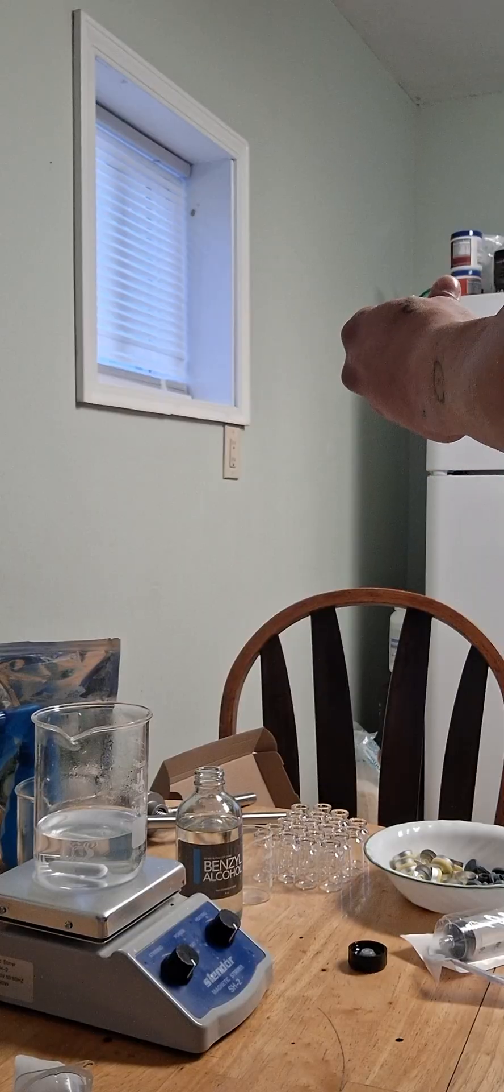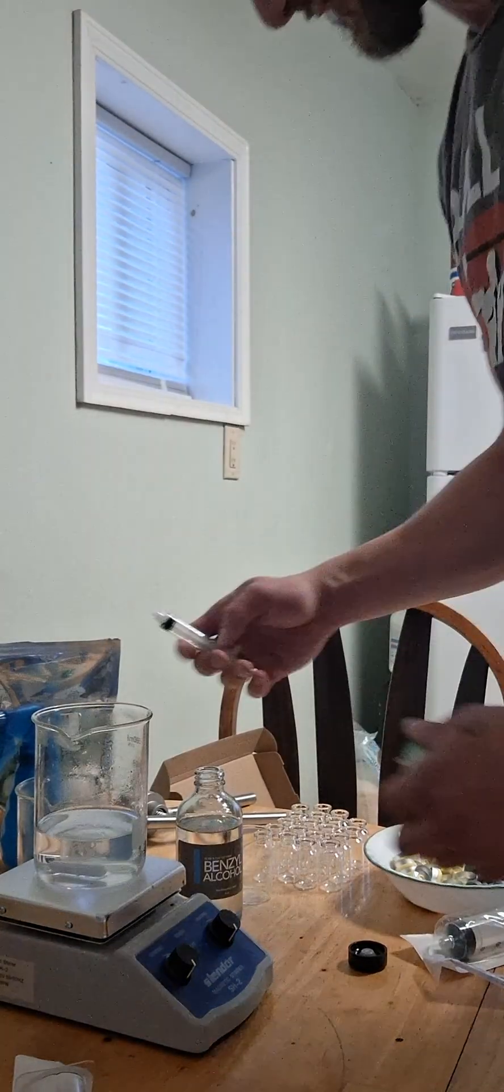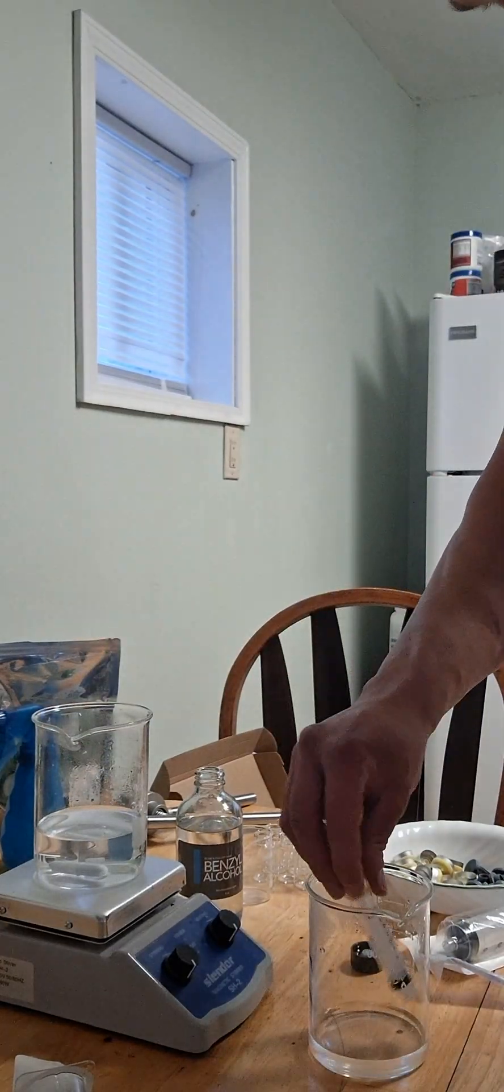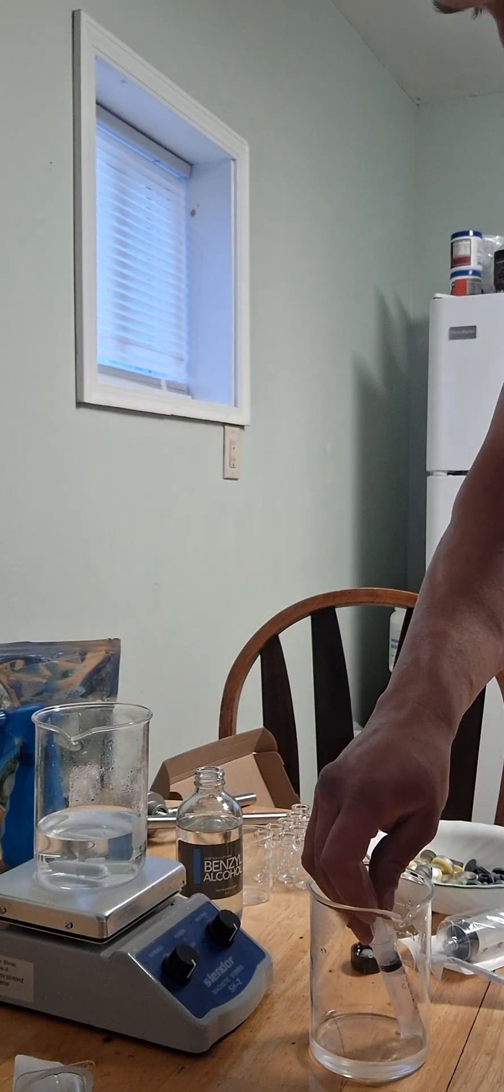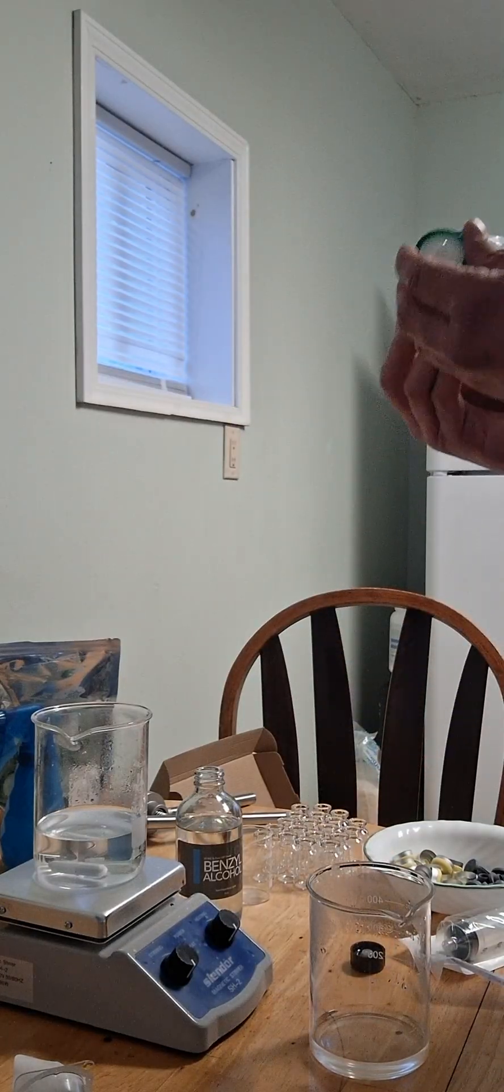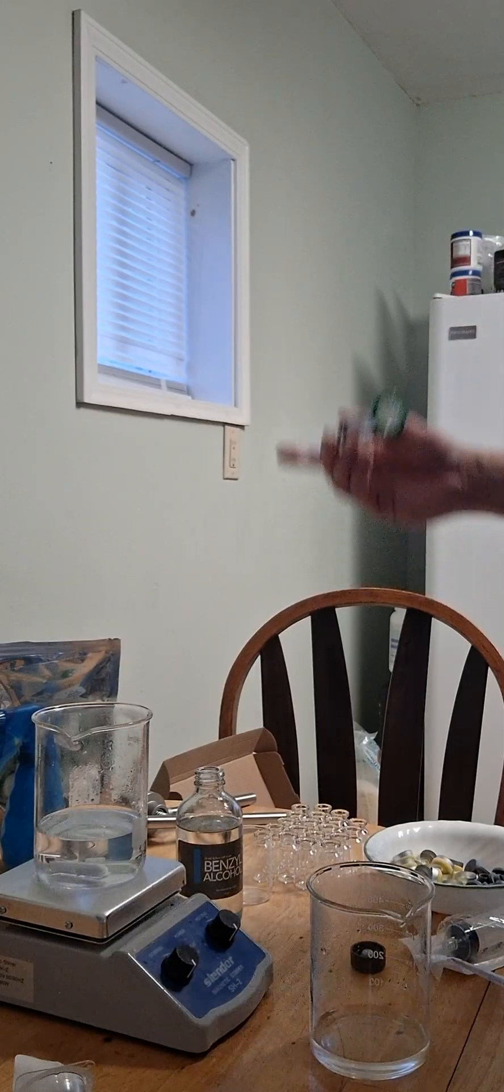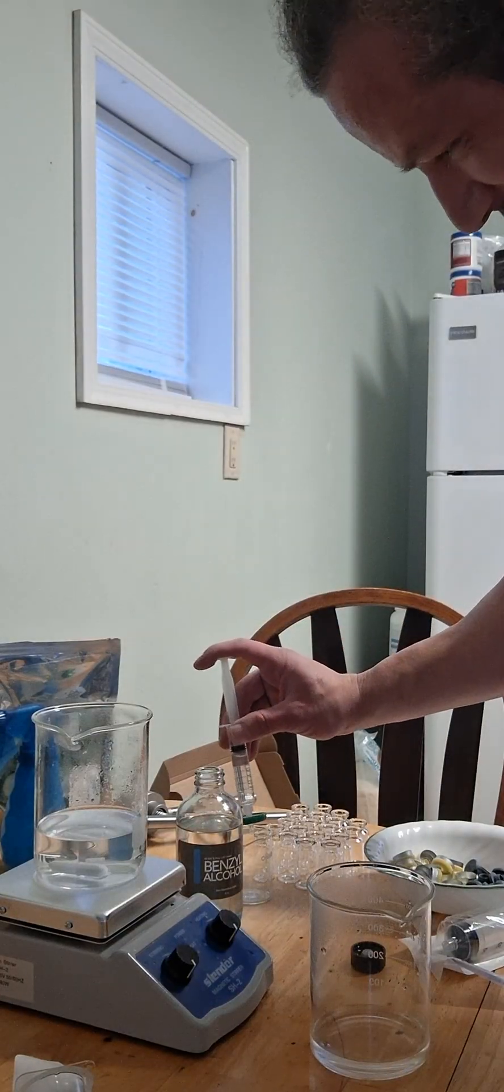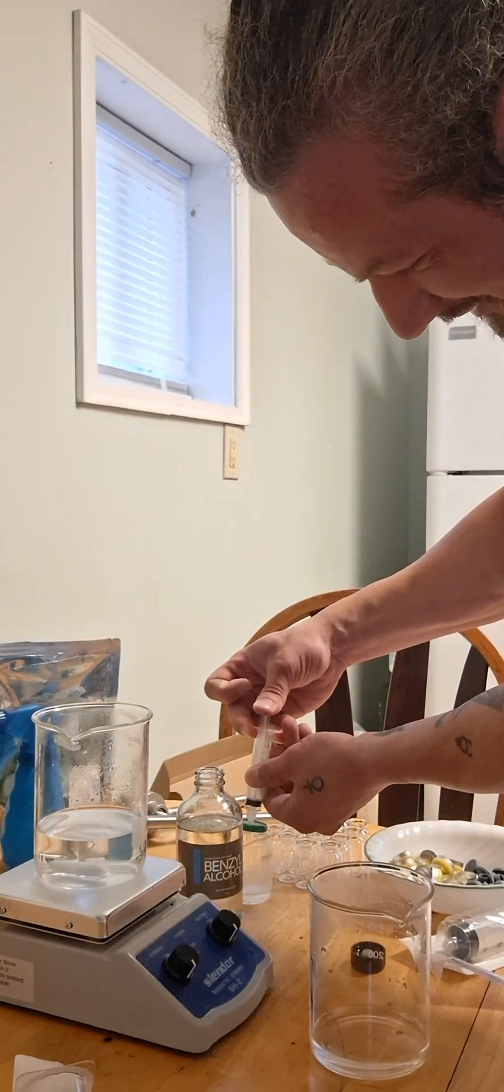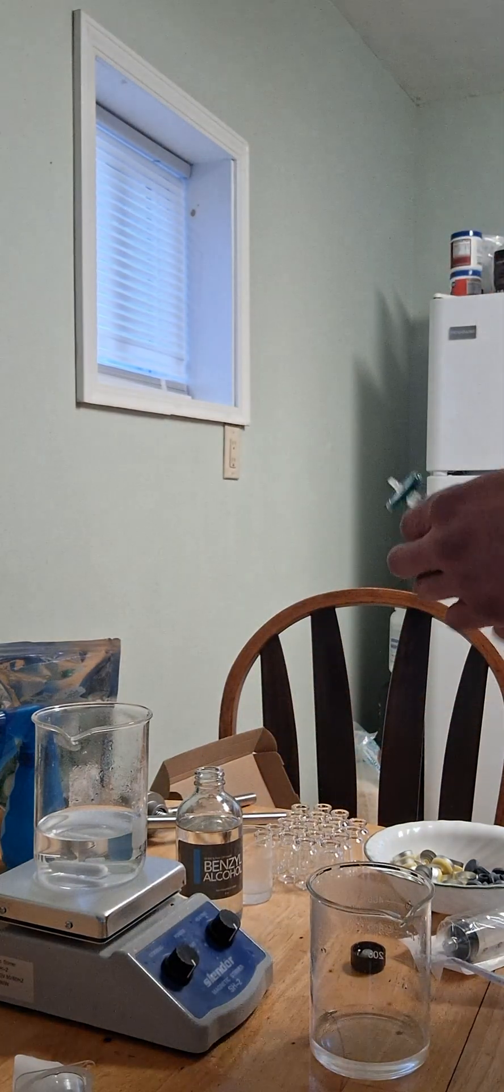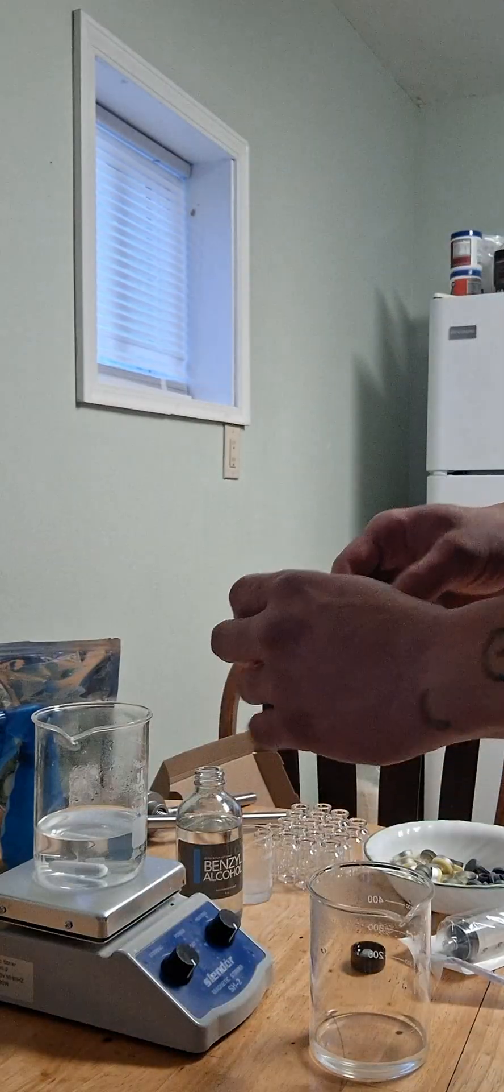And then what I do typically, just because I've noticed on some of them there is some particulate matter that's on the outside part of the filter, sometimes it'll go into the vial, so I just flush it with some of the distilled water. Use just a little bit of force, just kind of flush it through, and also it gets out the excess benzyl alcohol so that you're not getting an additional concentration there.